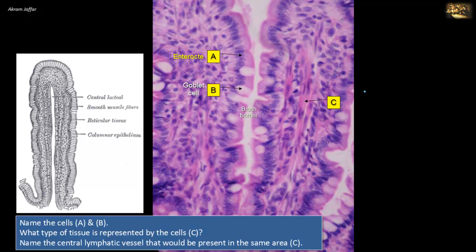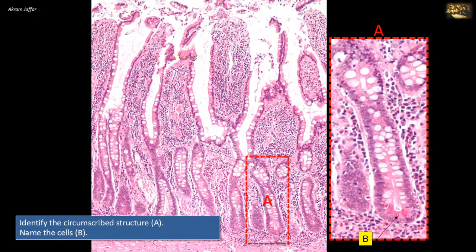The cells indicated by C are smooth muscle cells — smooth muscle fibers, extensions from the muscularis mucosa, which can be seen along the long axis of the villus. Identify the circumscribed structure A and name the cells B. This section shows features of the small intestine, where the mucosal surface has numerous finger-like projections called villi, while the mucosa between the bases of the villi is formed into crypts called the crypts of Lieberkühn, which are the structures represented in A — so A is an intestinal crypt.